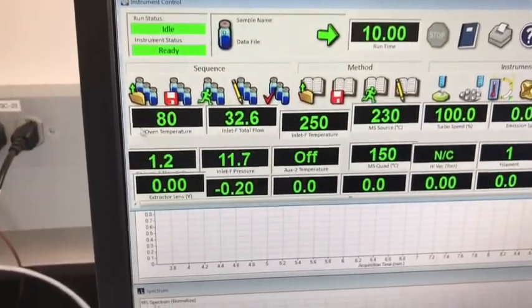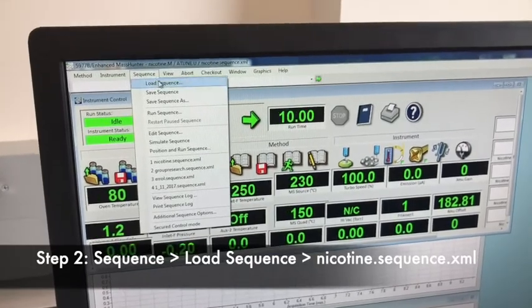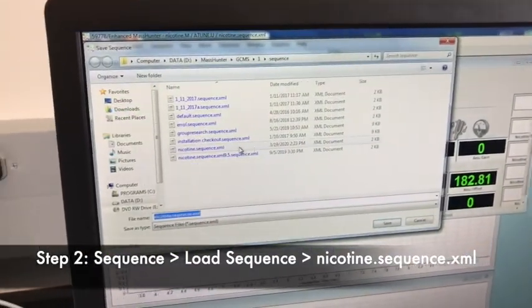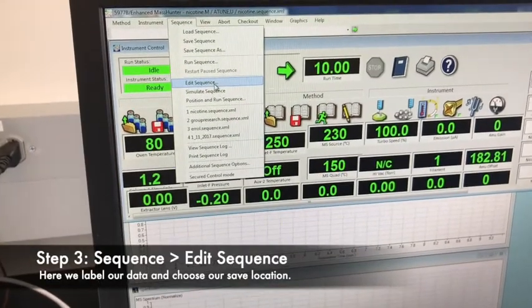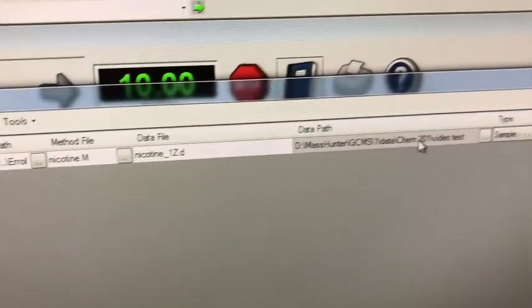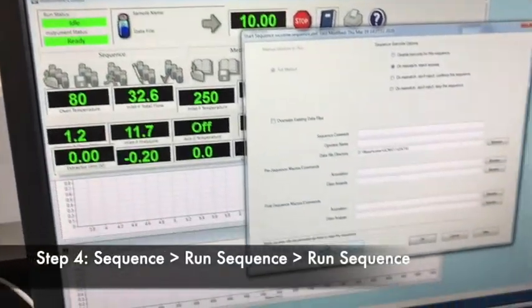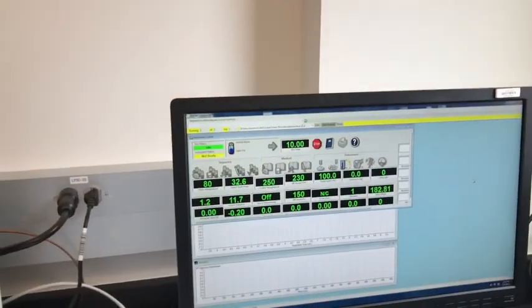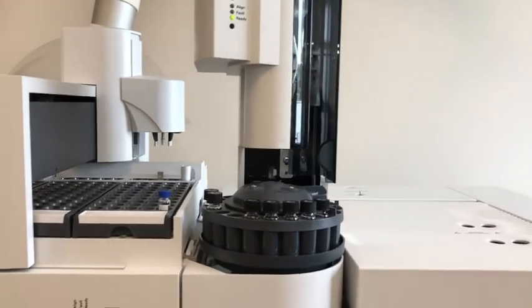Once our temperature has reached the right level and the system is ready, we go to Sequence, Load Sequence, and we load our sequence, which is obviously going to be nicotine. Then we go to Sequence, Edit Sequence, where we can see the method file, the data file where it's going to store the data, and so forth. Finally, we go to Sequence, Run Sequence, and click Run Sequence. That's when it starts getting things ready to run. I'll pan over to the sample now because it will be interesting to see how the sample is injected.